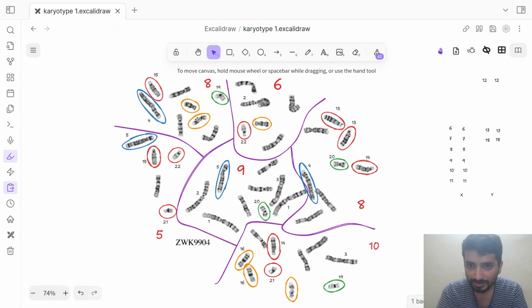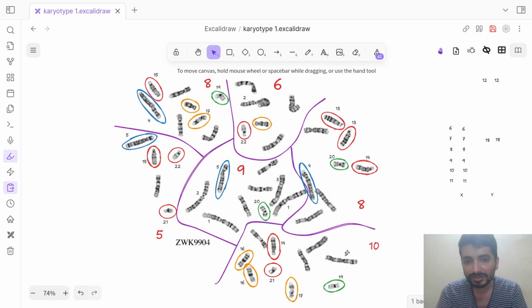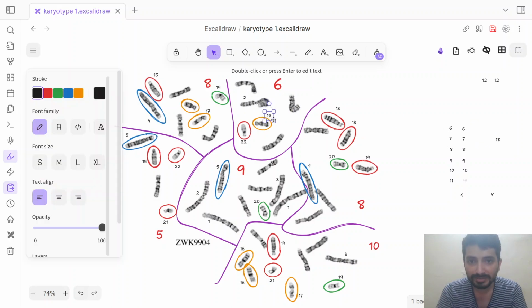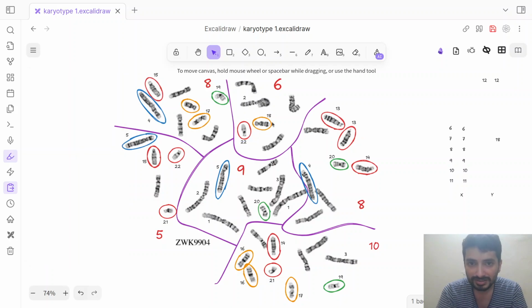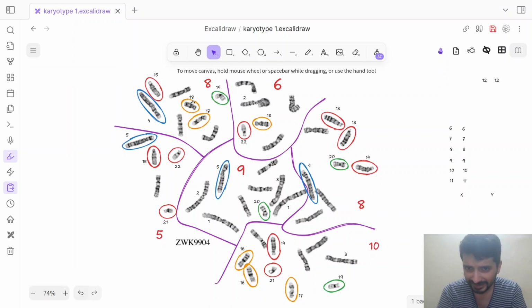And like I said, chromosome 17 instead of these three bands has only one band on the long arm, and this is chromosome 17, and this is chromosome 18. And just like that, by elimination, you can say that the other two chromosomes that we have identified in this group are chromosomes 18, but what gives them away is their box-like structure on the long arm. So the long arm is actually delineated by these two very dark bands, and it often appears quite short on metaphase spreads, and it gives some kind of an appearance of a box. So that is how I remember chromosome 18.